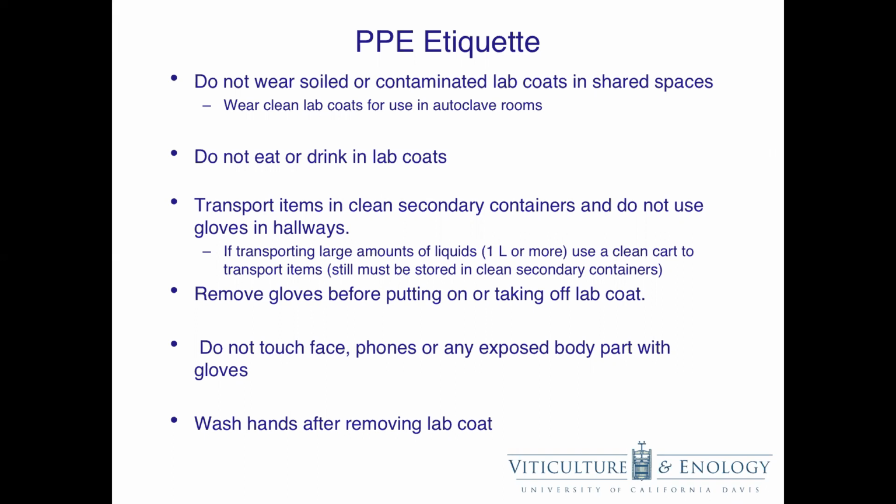Wash your hands after removing your lab coat. The idea is that your lab coat is contaminated, so once you touch it again, your hands are then contaminated. Washing your hands after removing your lab coat removes any hazard that was on your lab coat from your hands.